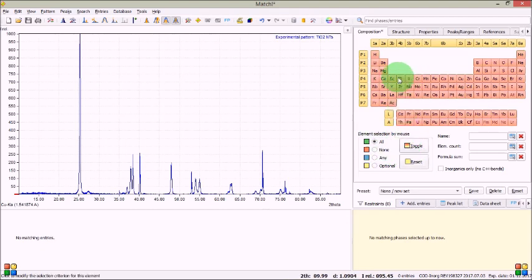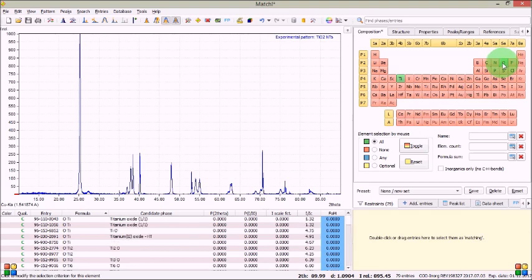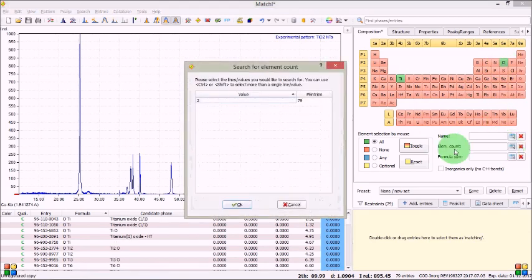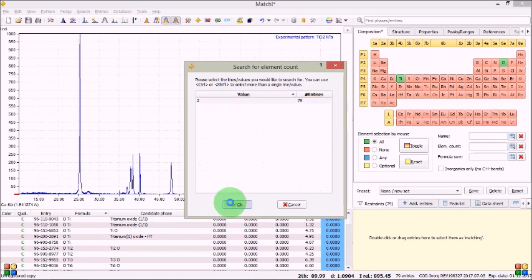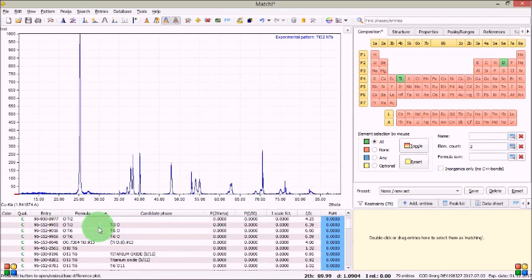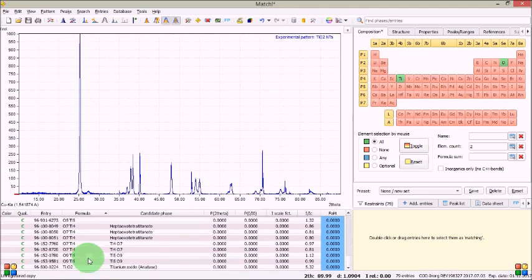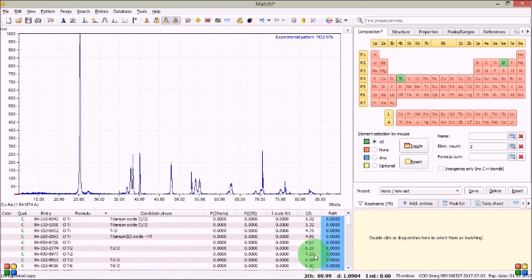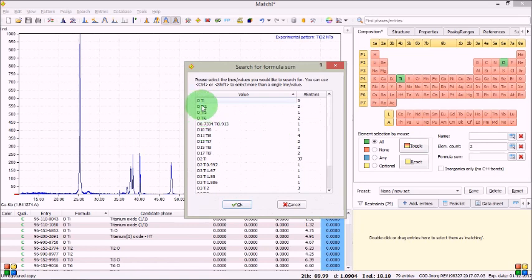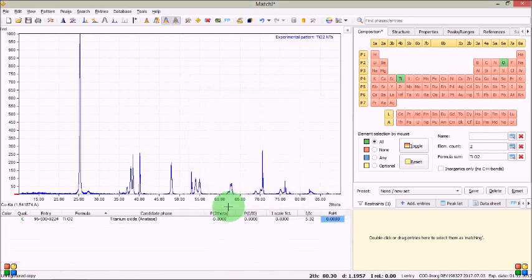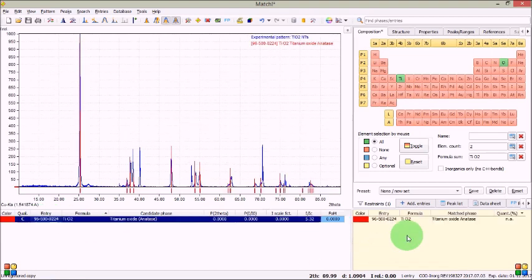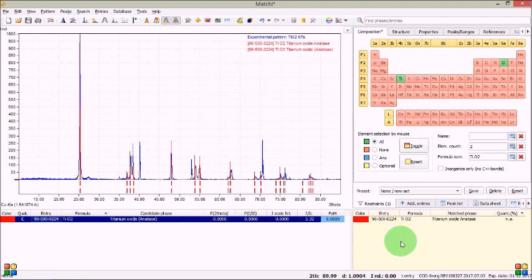So Ti, titanium and oxygen is there. So 2 is automatically selected there. You can see lots of data have come here appeared here you can select from it also but I shall select more precisely from here and formula you can see these different types of titanium oxide based structures are there but I am going to choose TiO2 okay and see this entry has come here you have to just drag it over here and drop it fine.